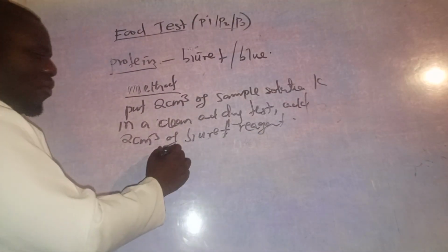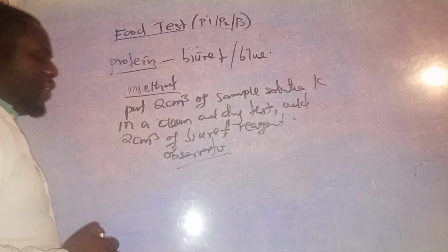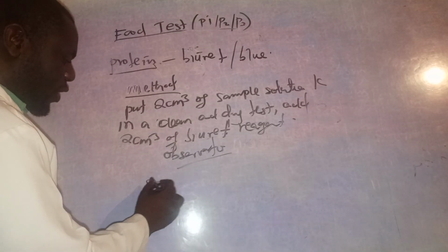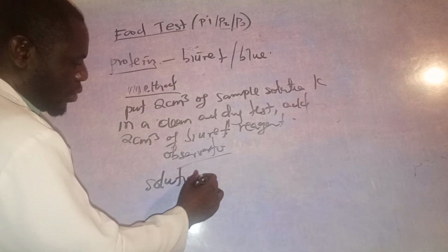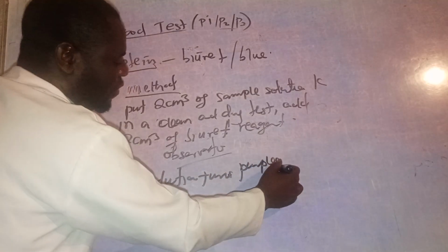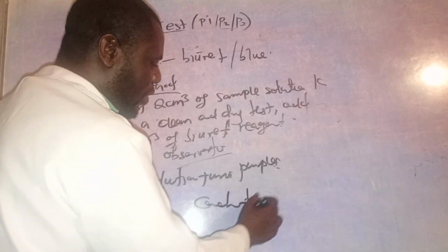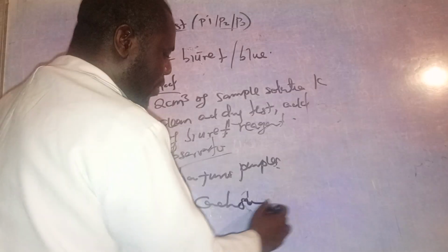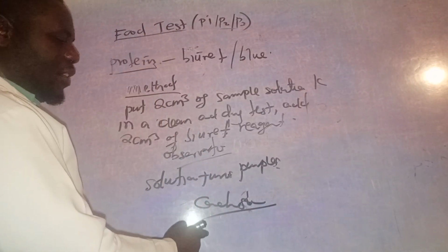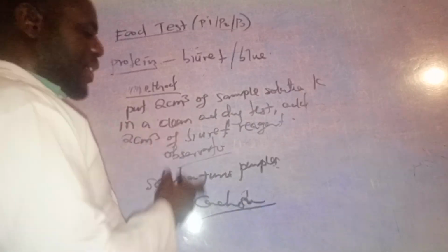Then from here, observation: you observe what will happen. If the solution turns purple, which means the conclusion will be that protein is present.